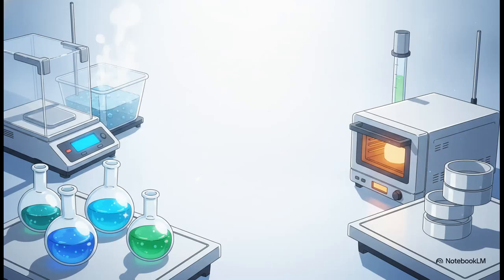To pull off this specific extraction, you're going to need some highly specialized gear. We rely heavily on an ultra-precise analytical balance. We're talking weighing samples down to the 10,000th of a gram. You'll also need a water bath equipped with a shaker that can hold a perfectly steady 65 degrees Celsius, some heavy-duty 250 milliliter boiling flasks, a 250-degree laboratory oven, and, maybe most importantly for this whole thing, Gooch crucibles, specifically Coors No. 4 crucibles fitted with glass fiber filter paper for the final vacuum filtration step.